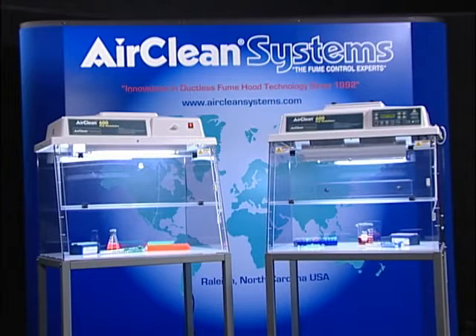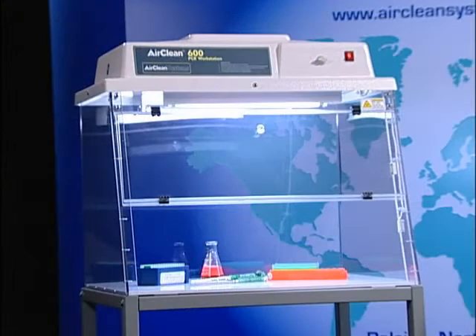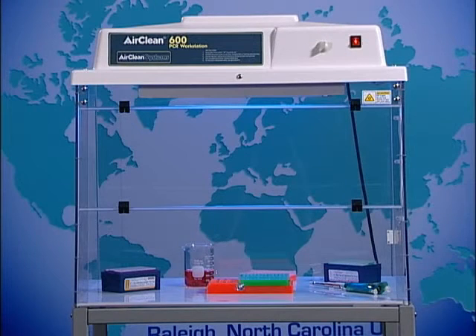AirClean Systems PCR workstations are available in two different configurations. The dead air box provides a circulation-free environment with UV light sterilization. This configuration is very popular, but it does not provide a total application solution.